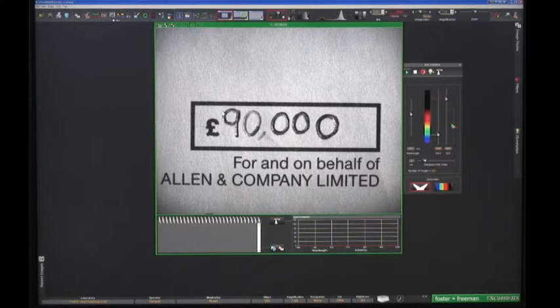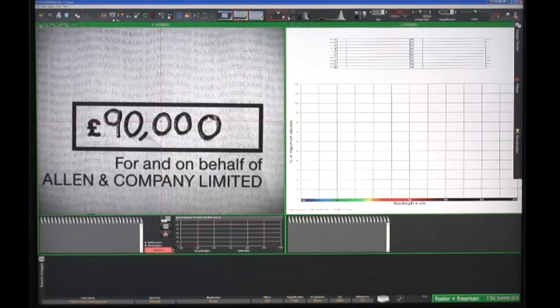One of the big benefits of hyperspectral imaging is that we have complete wavelength information for each pixel of the image. To exploit this, we can click on the spectrometer button either here or here. This brings up the spectrometer view, with the image on the left and a copy of the spectrometer graph on the right. The HSI panel is temporarily removed. A crosshair is placed on the image, and the preview graph displays the spectrum of the area at the center of the crosshair. We can drag the crosshair around the image, and the preview graph will display the spectrum at that point.